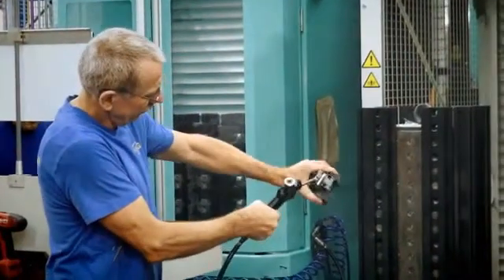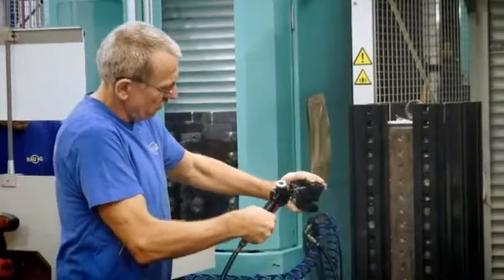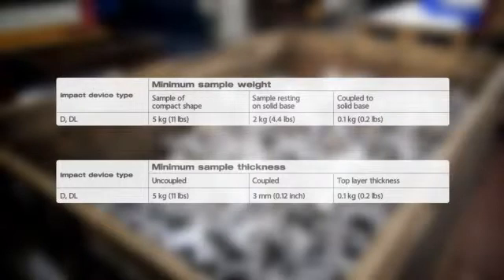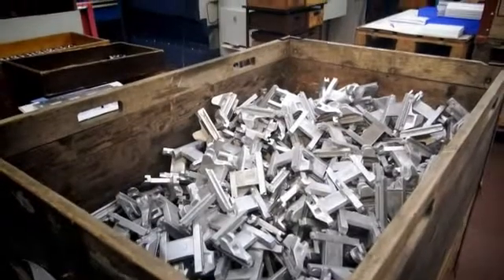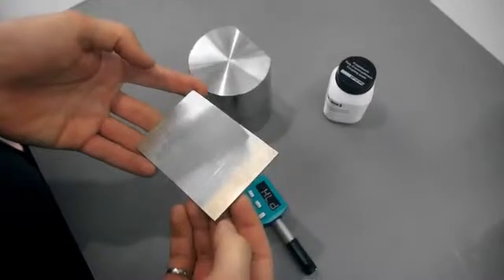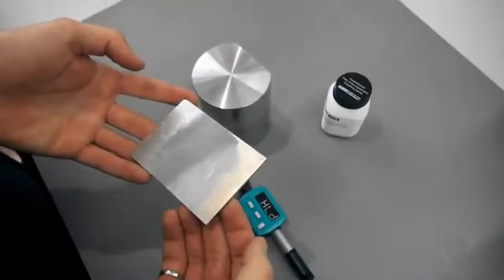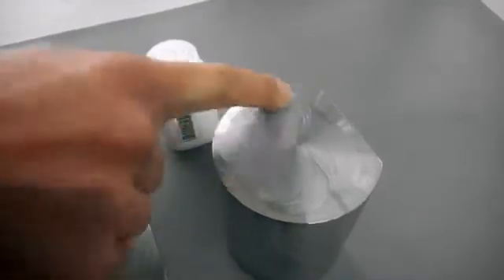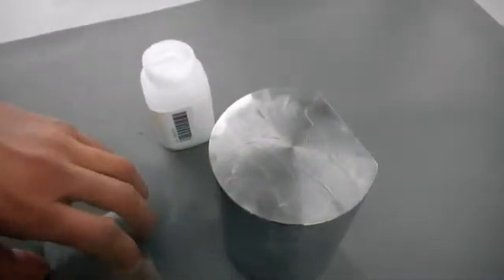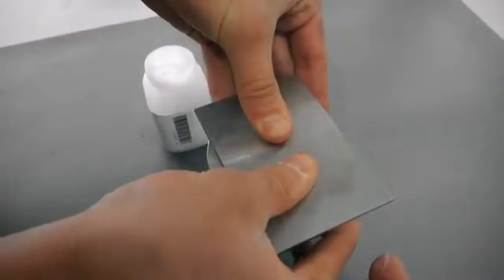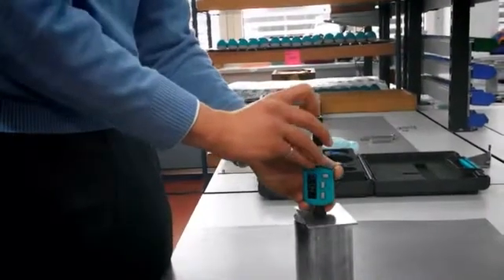Samples lighter than 5 kilograms or 11 pounds can vibrate during measuring, which distorts test results. Lighter samples should always be supported by solid worktops. If the mass falls below 2 kilograms or 4.4 pounds but still exceeds 0.1 kilograms or 0.2 pounds, coupling the sample to a larger mass, such as a workbench, can help prevent vibrations. The surface of the sample and the solid support must be level, flat, and smooth. The sample should be at least 3 mm or 0.12 inches thick. Apply a thin layer of coupling paste to the contact surface of the sample. Press the sample firmly against the support and rub it in a circular motion. Perform the measurement as usual. However, the impact must be carried out perpendicular to the coupled surface.